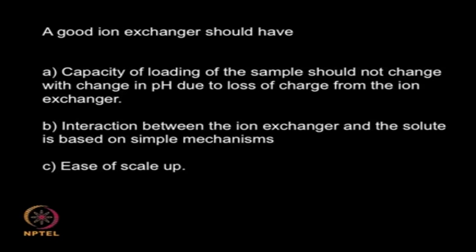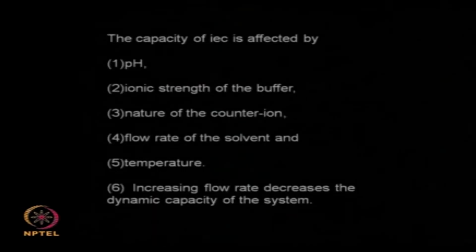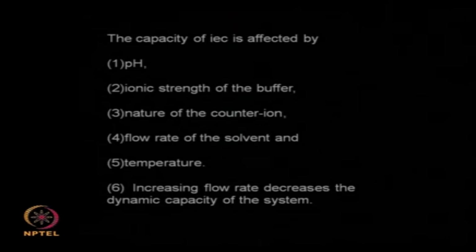It should be easy to scale up, because I may want to do an exchange in a lab scale setup, then scale it up to a very large manufacturing setup. The capacity of ion exchange chromatography depends upon pH, ionic strength of the buffer, nature of the counter ion, flow rate of the solvent, temperature and so on.